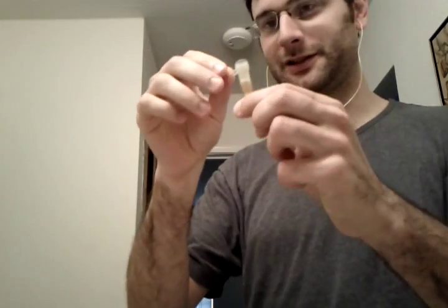So, here is the processed sample. It's kind of warm from the friction, but there you go. The DNA should be bashed out of all the cells, and it should be stable at room temperature for at least a couple of months, so. There we go.